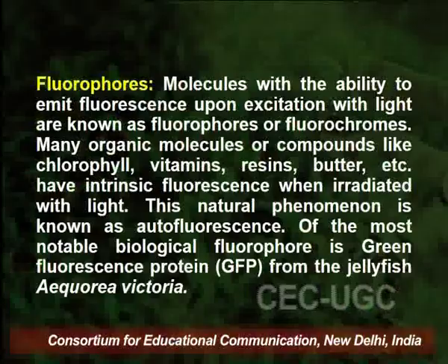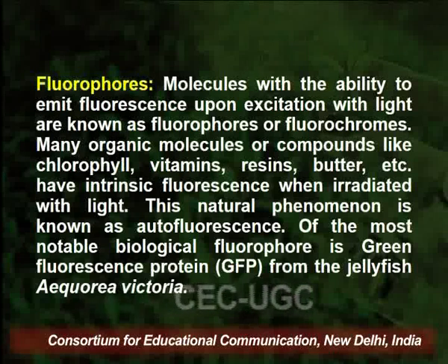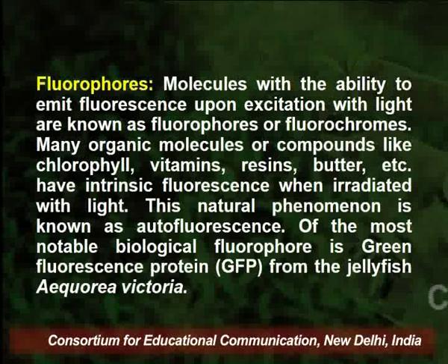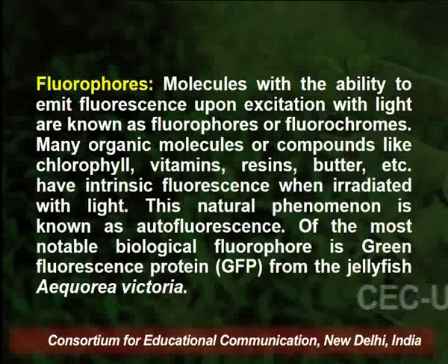So let us talk about fluorophores. What are fluorophores? So fluorophores are the molecules which have the ability to emit fluorescence upon excitation with light. They are also known as fluorochromes.